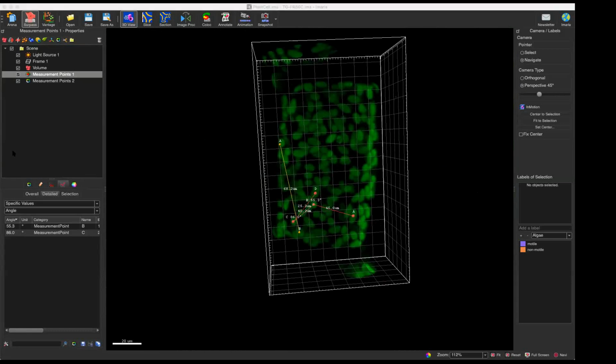Okay, I will go to the next topic. The next topic is spot and surface. As you can see, in the previous session we talked mainly about the visualization of your image. Now we will go into the part which is how to analyze and get the data from your images, which we have to do through a step called detection or segmentation, which is to separate the target object from your background or from the other components.